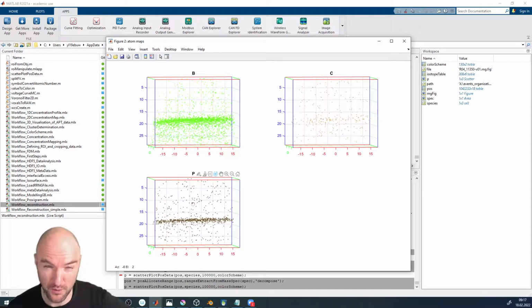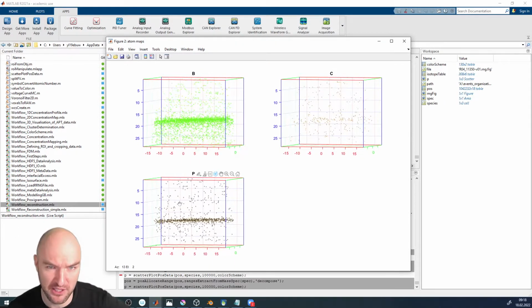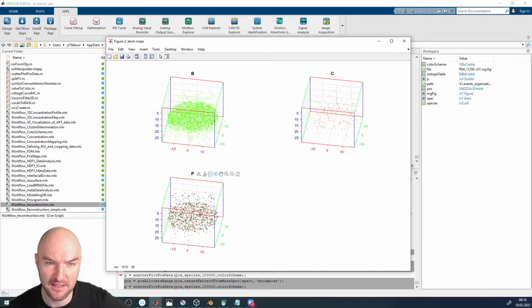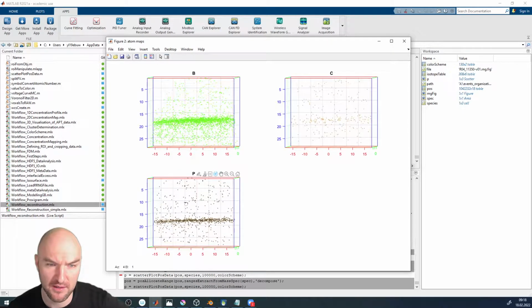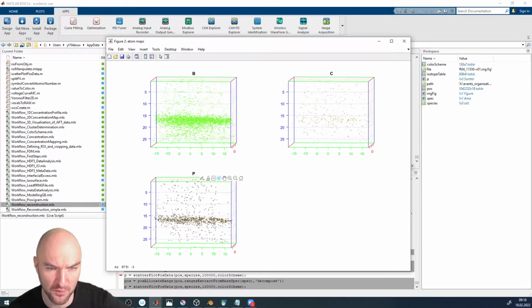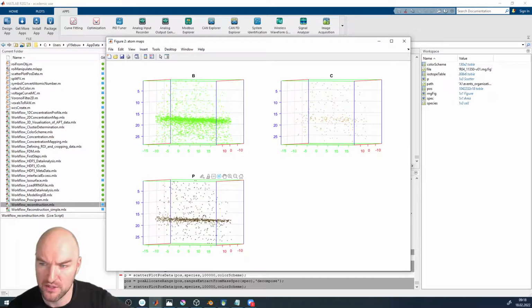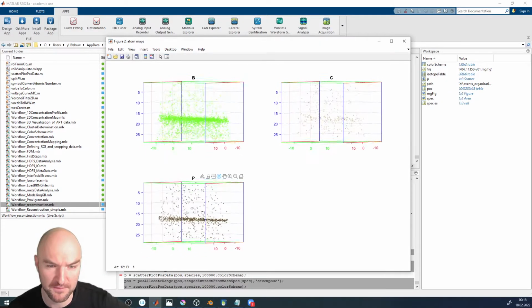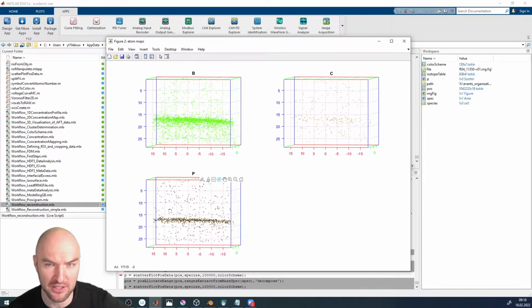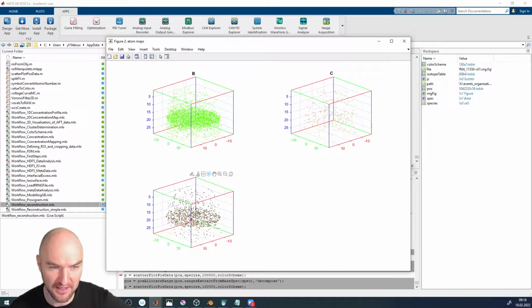Unfortunately, with Blender 2.8, that broke because they updated a lot, so it was essentially a complete recode of Blender. So what we're doing now is, starting next month, I have a student that's going to code an Atom Blend 2.0, which is going to work with the new versions of Blender, and which is also going to make use of a lot of the really cool new stuff that Blender can actually do. But for now we're going to do the smallest common denominator. We're going to go back to our OBJ files.